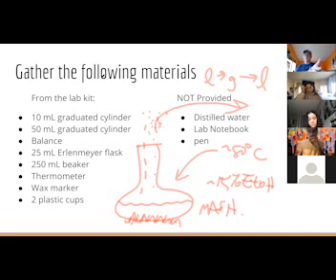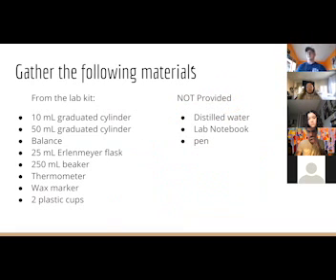Yeah, so when we distill water, we boil it at 100 degrees, and then all of the salt and ions and minerals and, you know, dirt and whatever else that's in it basically gets left behind. Okay, yeah, so that's distilled water. If you don't have distilled water, filtered water is okay.